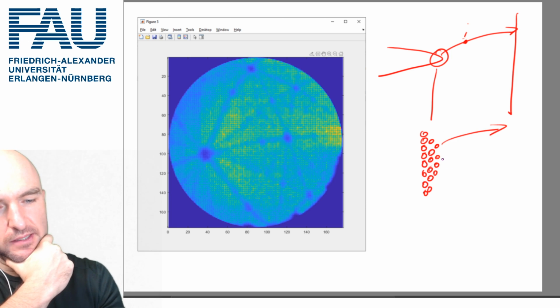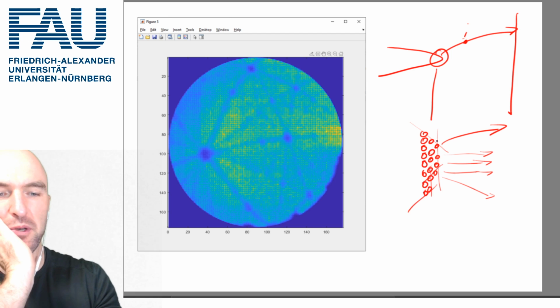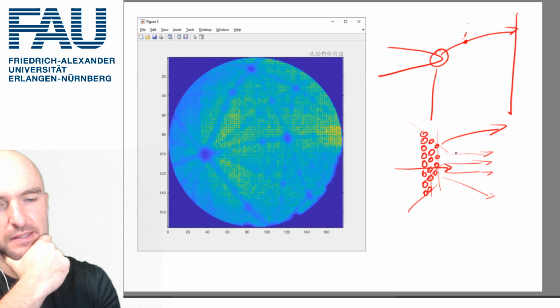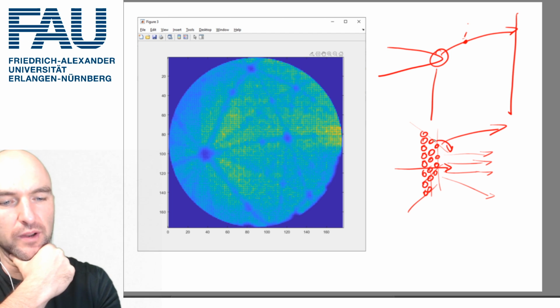And so what you can see here is that the electric field isn't quite the same for all of the atoms, right? Because here you've got a facet, and here you've got a facet, and here you've got a step, and then a facet, and so on. And most importantly, at these facets, this is a low index crystallographic direction. In those low index crystallographic directions, we get some field distortions and some effects, where an atom, for example, before it evaporates, can move a little bit, it can roll up.